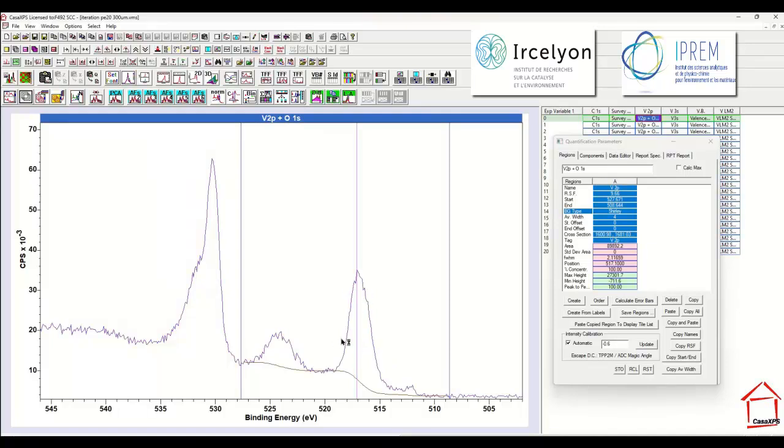And the reason this is a problem is that the ratio of this vanadium 2p 3/2 peak compared to the vanadium 2p 1/2 peak is not in the ratio that we would expect if we choose a background of this form. It looks like it's working reasonably well in the sense that the background does not cut through the data significantly. This is a Shirley background, except there's a small metallic peak here, and therefore there must be a small metallic peak over here, and it looks quite difficult to identify that second peak given a background of this form.